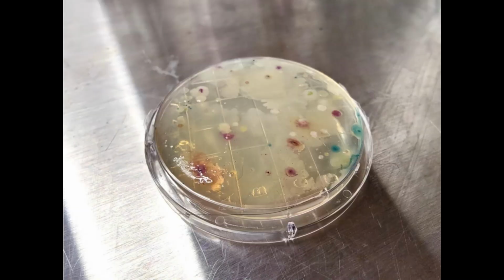But let me show you two plates to illustrate a point here. So first off, here is what's called a contact plate, and I'll show you what that is in a second. It's a small petri plate, and you'll see a whole bunch of clear or yellow colonies. Those are typical bacteria. That's how bacteria look. They look clear, yellow, mucus, yucky looking, yellowish. Then you see a few colonies that are red. Those would be the coliform colonies. And then you see a couple of colonies that are blue. That is E. coli. Now we can see the different colors that show up on this plate.